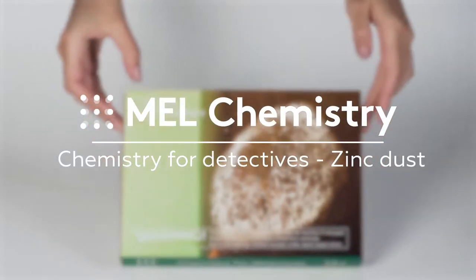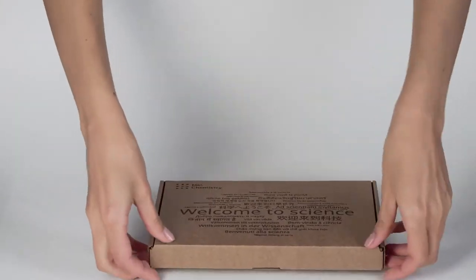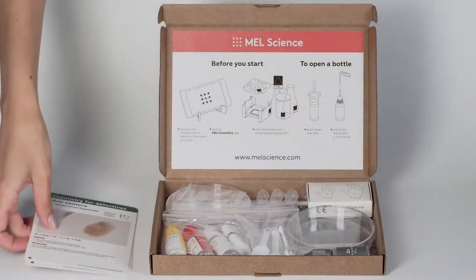Welcome to the wonderful world of chemistry. Today with the help of the Chemistry for Detective set by Mel Chemistry, you will develop a fingerprint on a piece of plastic using zinc powder.